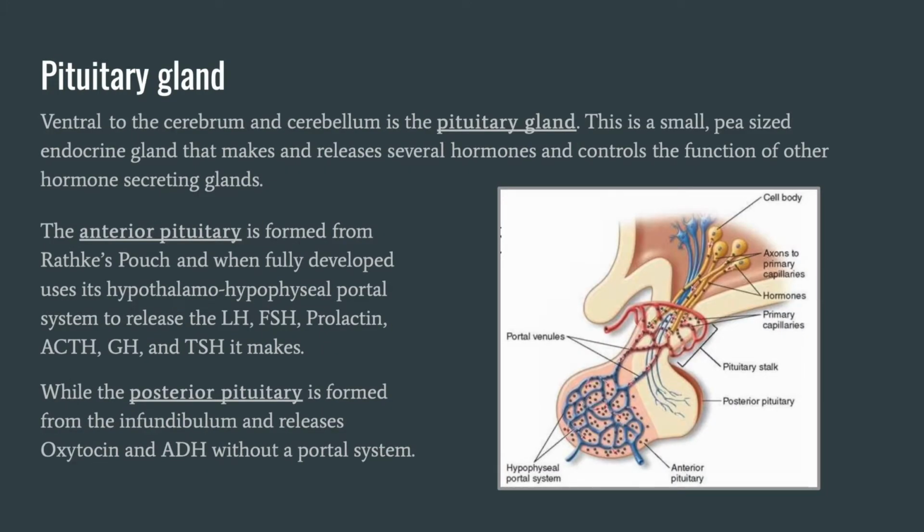Next, we're going to discuss the pituitary gland, which is an endocrine gland that makes and releases several hormones and controls the function of other secreting glands.